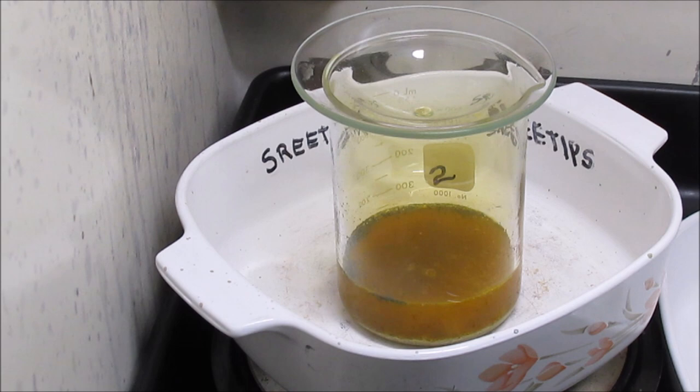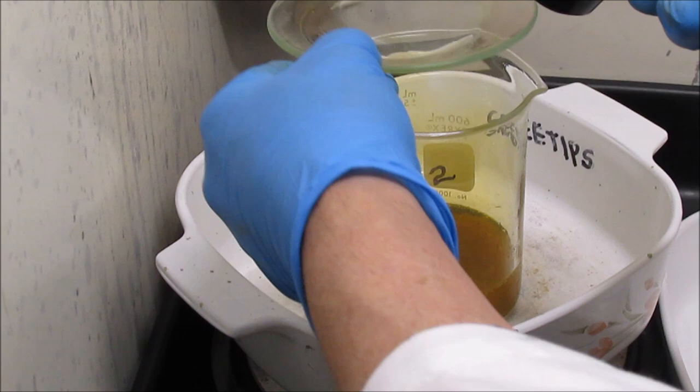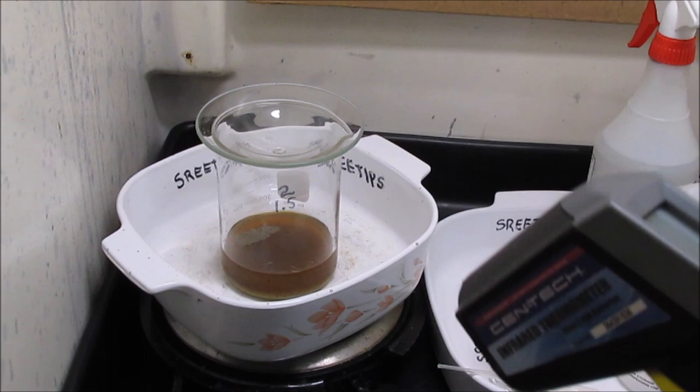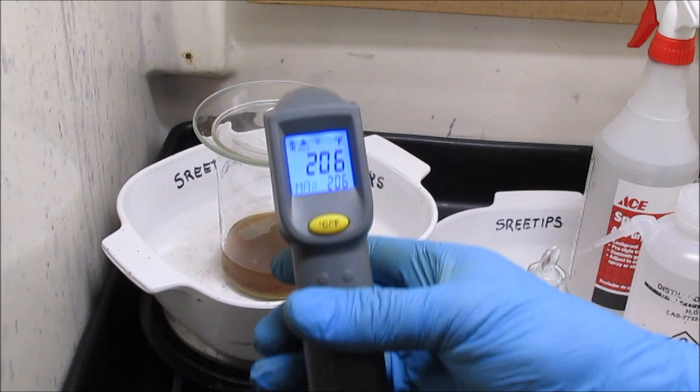Turn the heat down in there. Right now it's only 166. Beaker's been on the heat now for about 1.5 hours. Temperature says 206 inside of there.